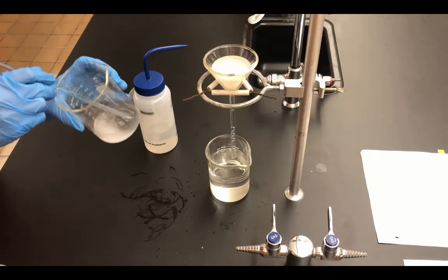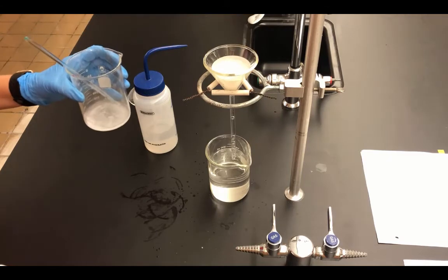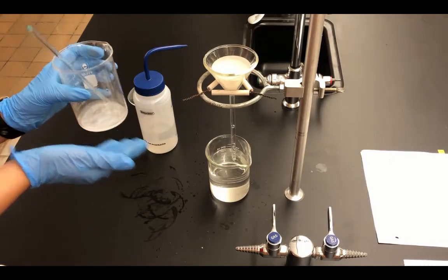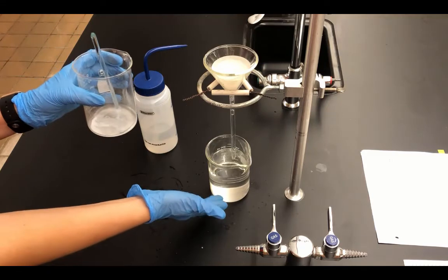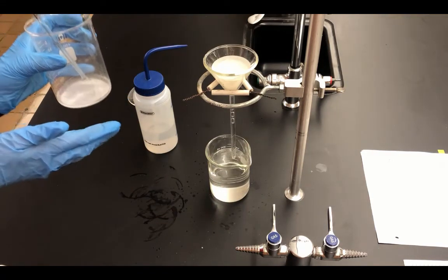So you want to try to scrape the bottom as much as you can, and you want to continue rinsing into the filter paper. The water that you're adding is not going to affect the solid at all, because it's going to get filtered down through into the filtrate. But you want to make sure you get as much out of the beaker as possible.